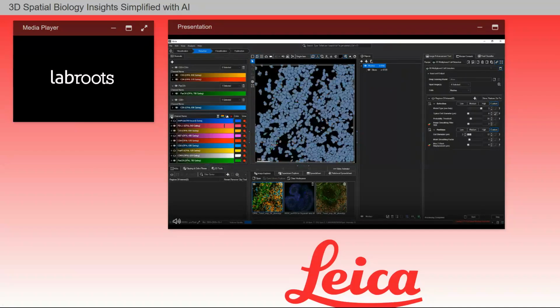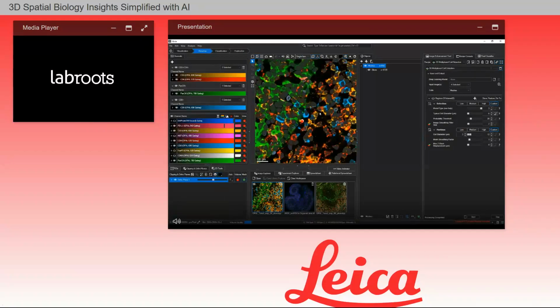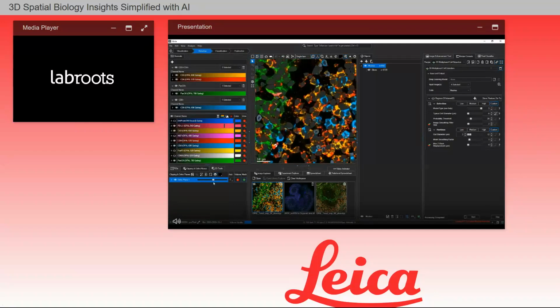Next, let's examine the results more closely. I am going to the clipping plane tool and adding an ortho slicer to the image. I am going to add a clipping cap and make it black so that I can view both the mesh and the underlying fluorescence signal. I will now use the slider to move up and down the Z-plane, and as you can see, the mesh object contour matches up nicely with the image channels.